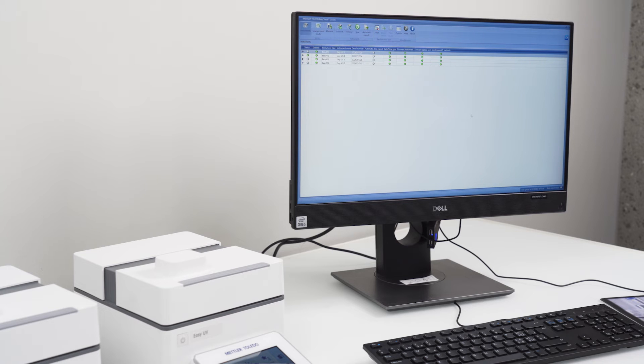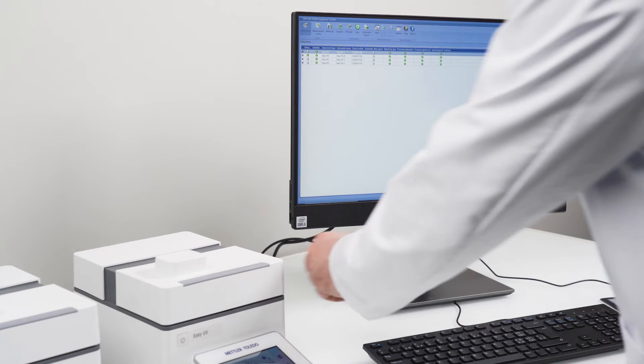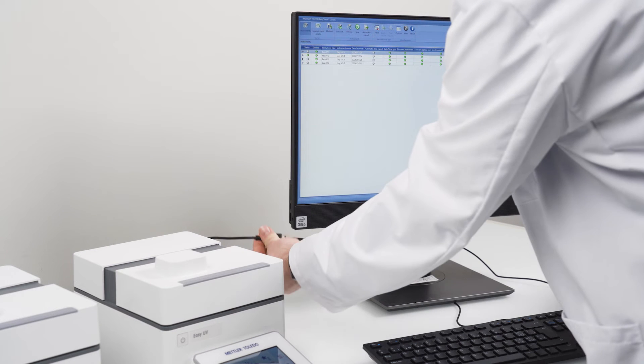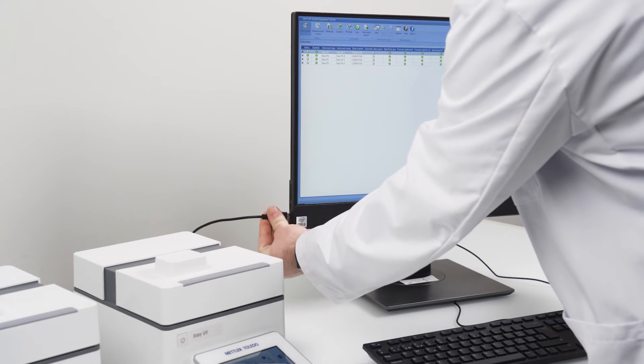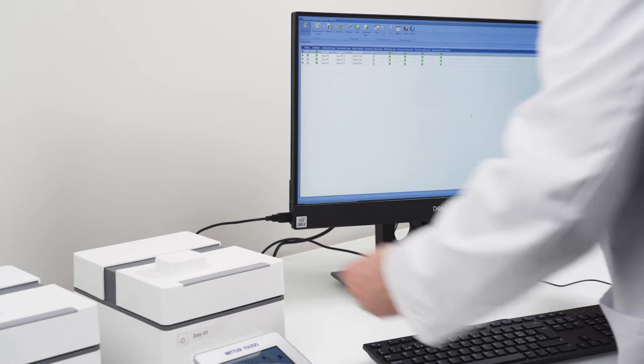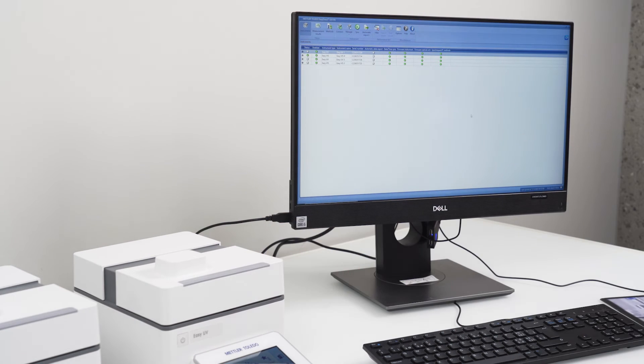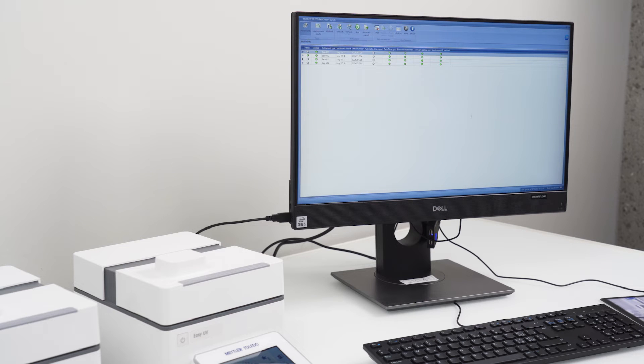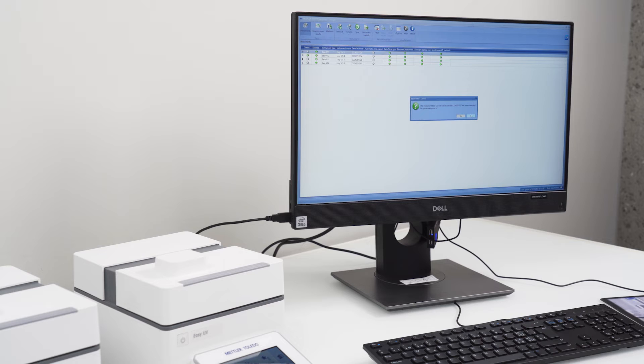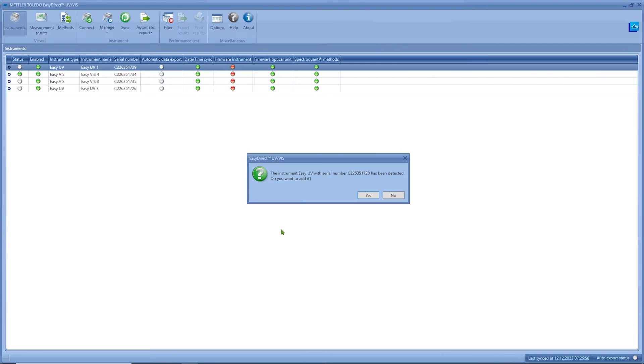To add an instrument to your EZ Direct UV-VIS software you just need to plug in the USB-AV cable from the instrument to your computer. The software will automatically detect the new device. It is asking you whether you want to add it.